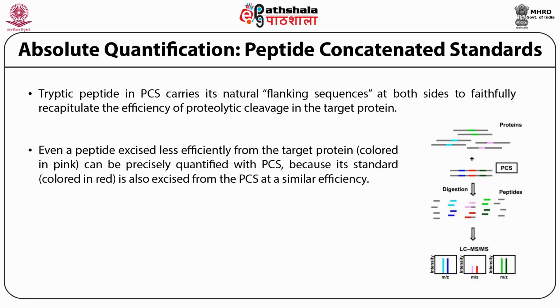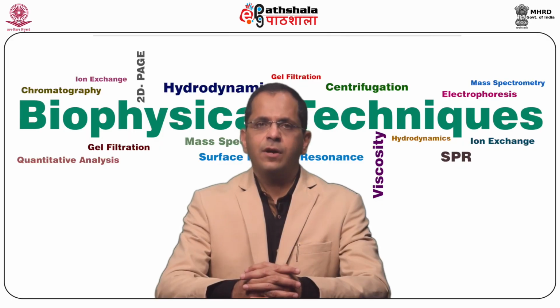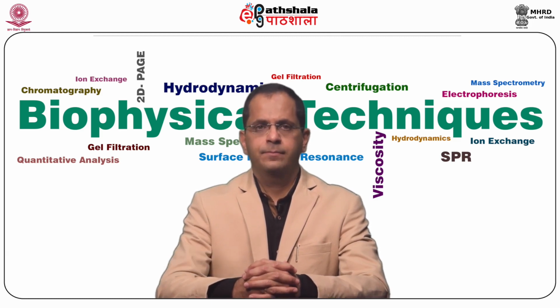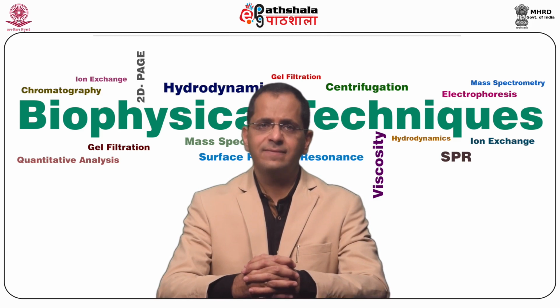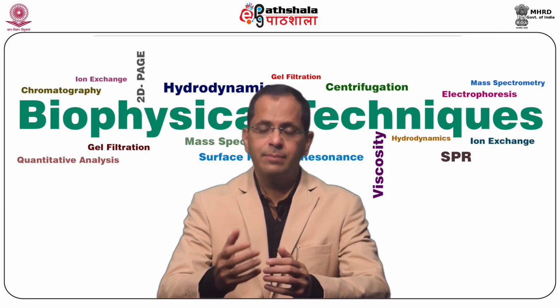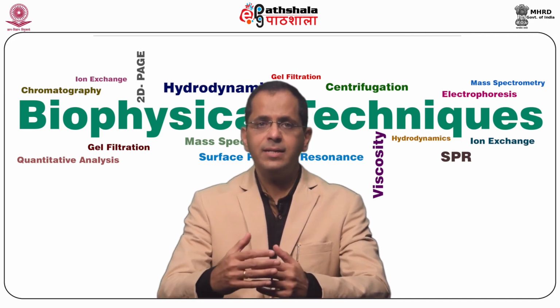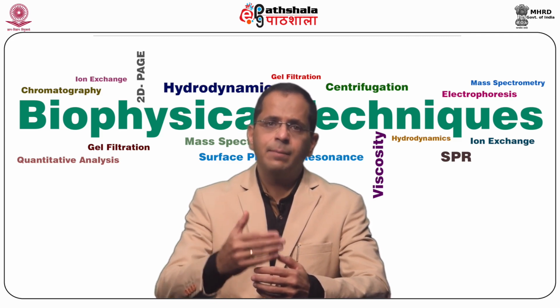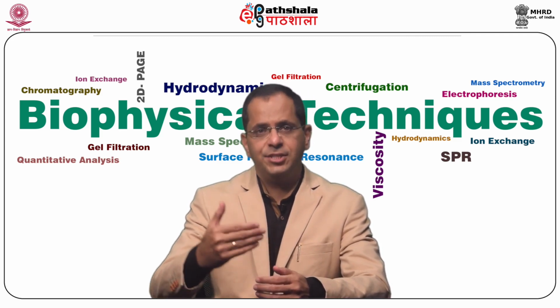Disadvantages of labeling based quantitative proteomics. It requires expensive labeling reagents. It requires high amount of starting samples. Multiple sample preparation steps result in a considerable sample loss and reduced detection sensitivity.